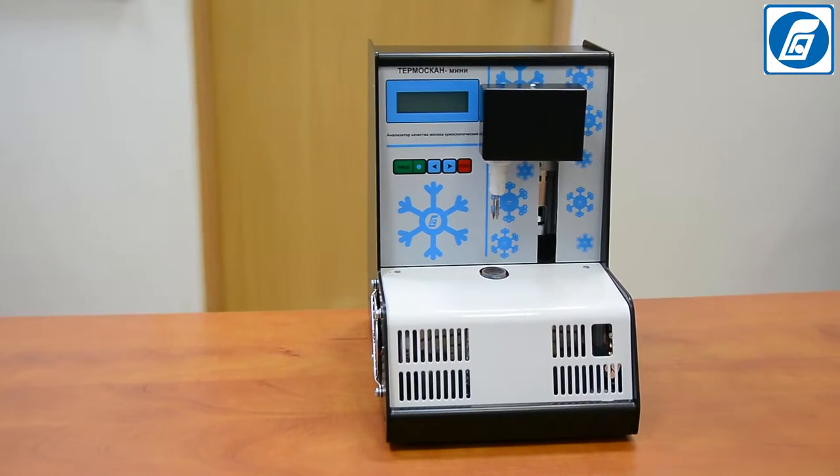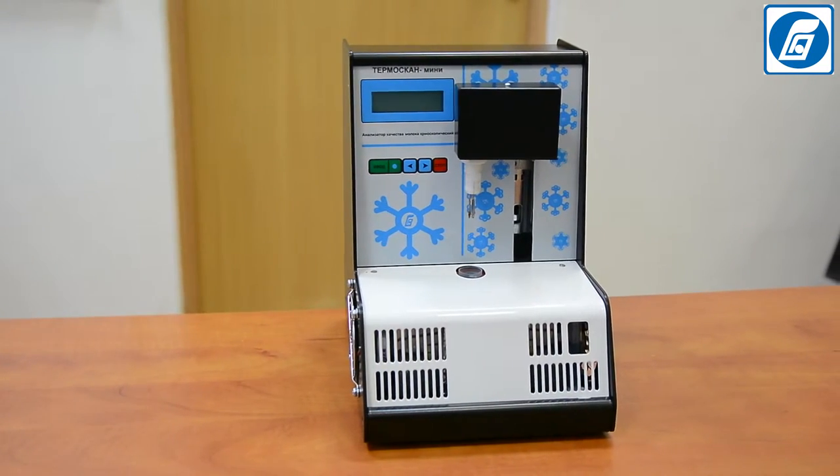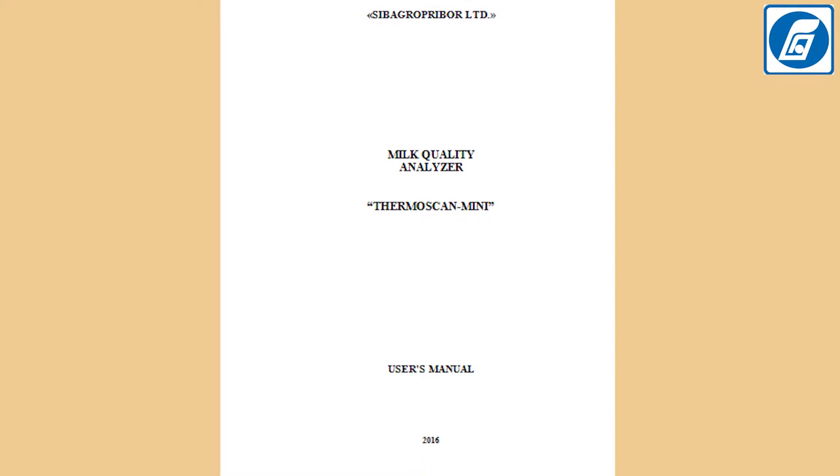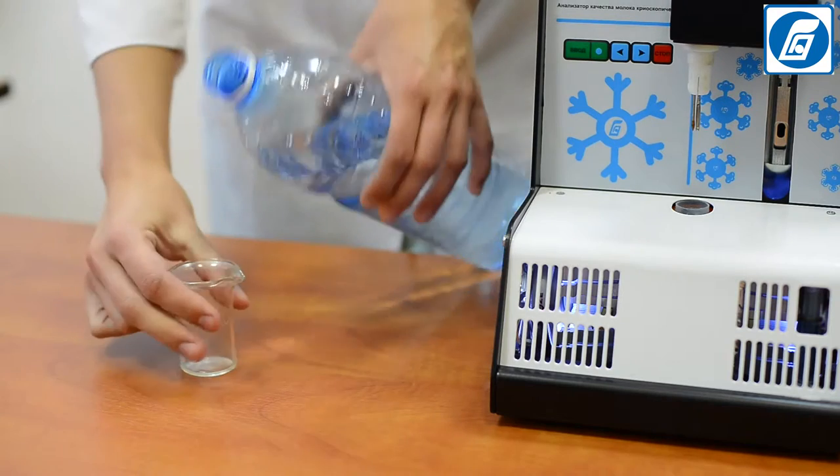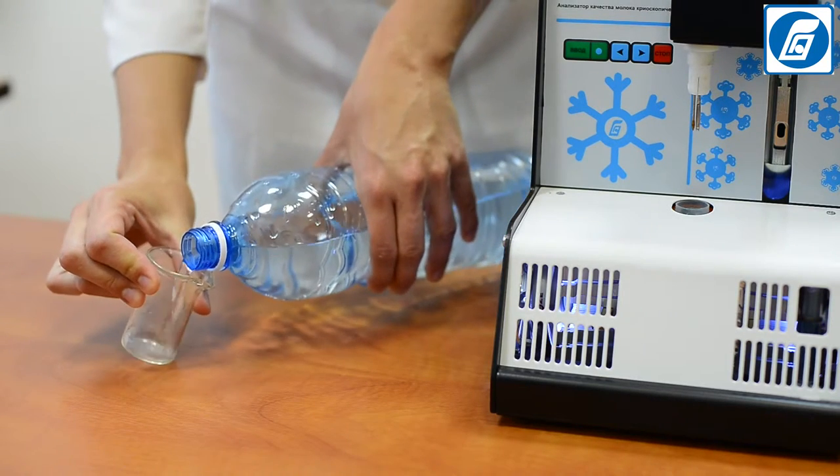Before starting work, it is necessary to read the operation manual and safety measures. We recommend carrying out testing of the analyzer after transportation using the standard solution.